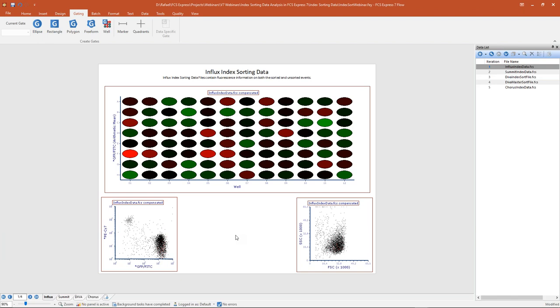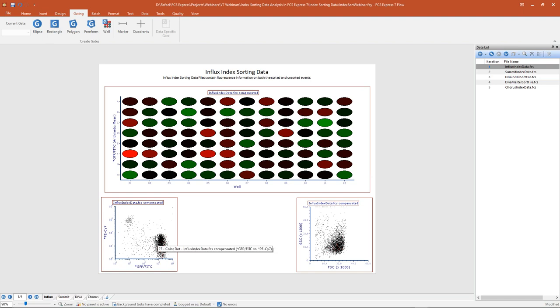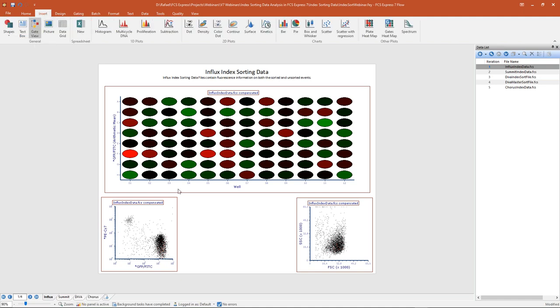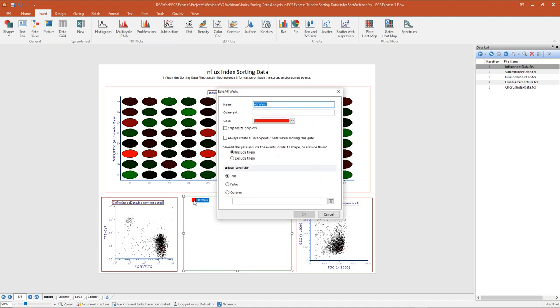The emphasize on plots feature increases the pixel size of events within our gate — in this case, the all wells gate — so that we can isolate and analyze those events much easier on our plots. To activate this feature, we need to edit the gate properties using our gate view, which is located on the insert tab. By double-clicking the box next to our all wells gate, we can edit its properties and select the 'emphasize on plots' option. When I check that box, the pixel size of events within the gate will be increased.